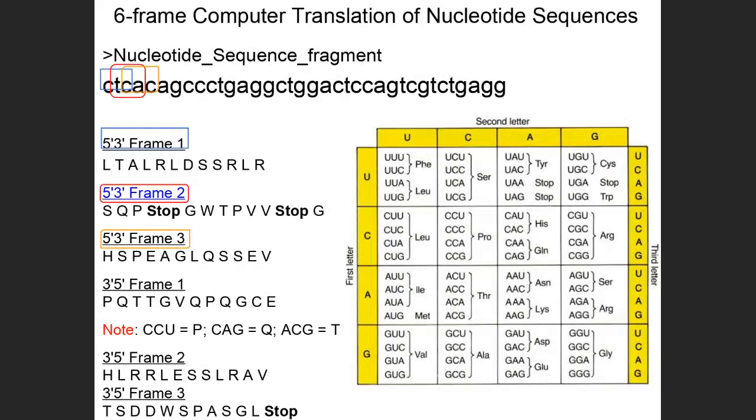So I'm going to share with you a slide you've seen before from this class about using BLAST. This is when I told you about the 6-frame translation. Keep scrolling down. Slide 26. There you go. So remember this? I told you, imagine you were given this DNA sequence. What are the 6 possible proteins it can make? And you're like, oh my God, I'm not going to have time to do that. Yeah, you won't. You're not going to do this by hand. This part is to show you how BLAST comes up with 6 possible proteins that will come out of one string of DNA that you enter.